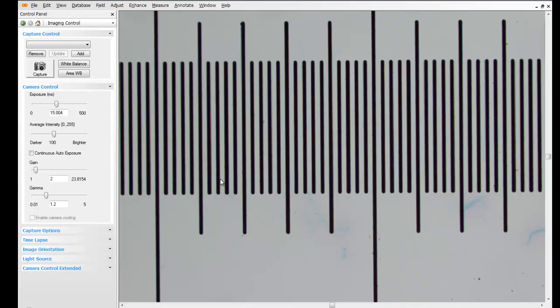The use of fit to window can also be applied to captured images to provide a one-to-one display scale for an area of the image. We recommend turning off the fit to window option on a captured image that is about to be used for calibration. Now let's go through those steps.